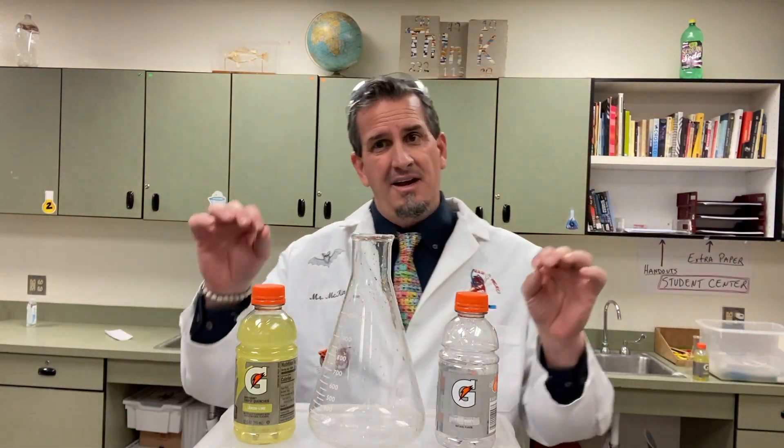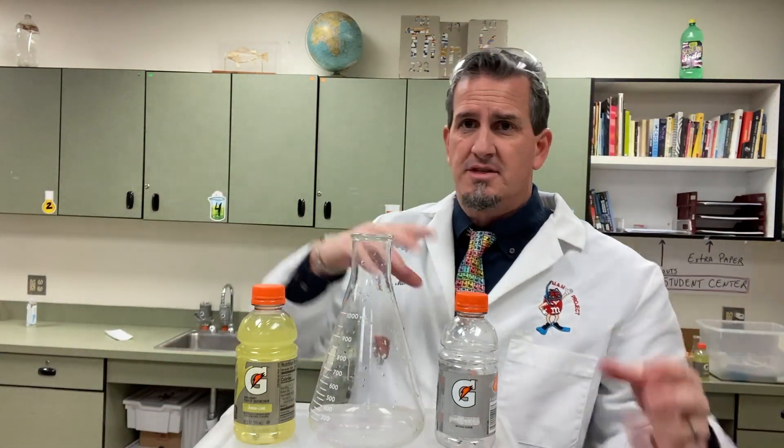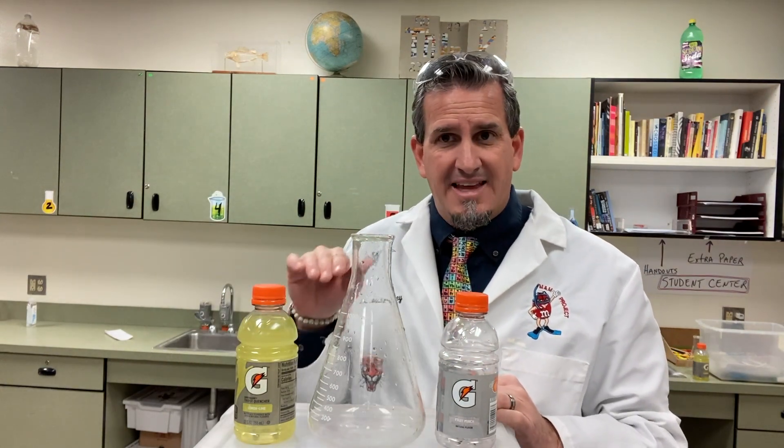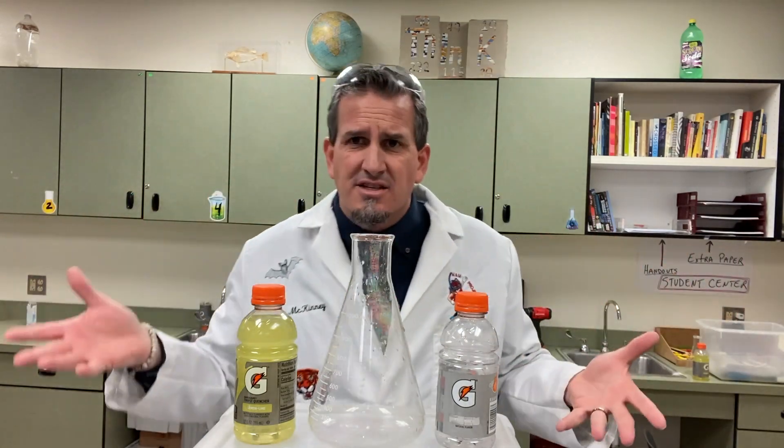Please keep in mind that depending on the level of education, this can be used all the way from elementary school just to show color changes, maybe introduce acids and bases, up to where I was at with middle school — I'll tell you exactly what my students' level was at that time — and then even up into high school for acid-base titration or chemical neutralization of acids.